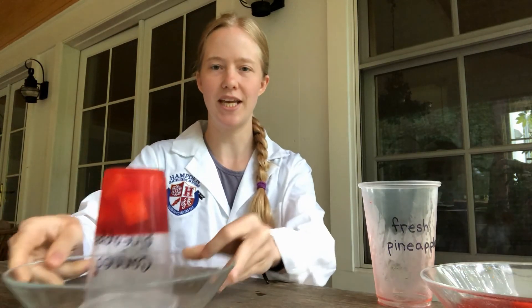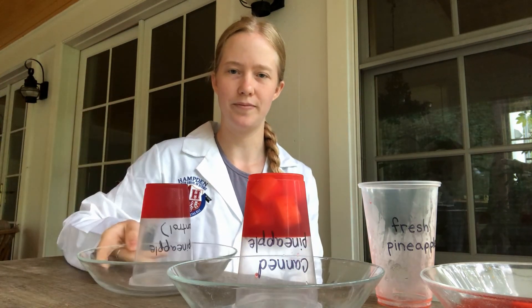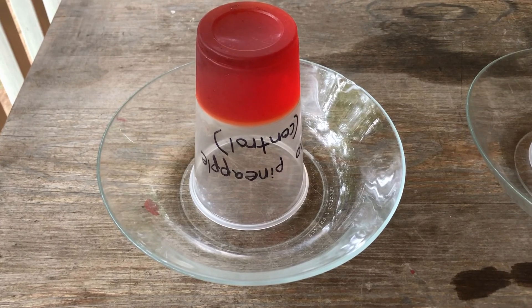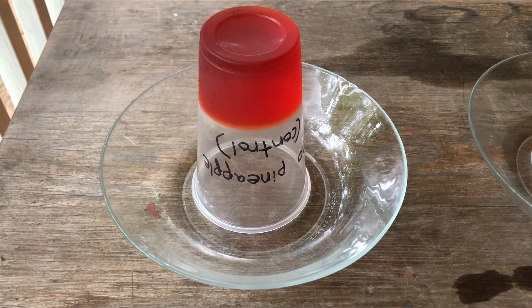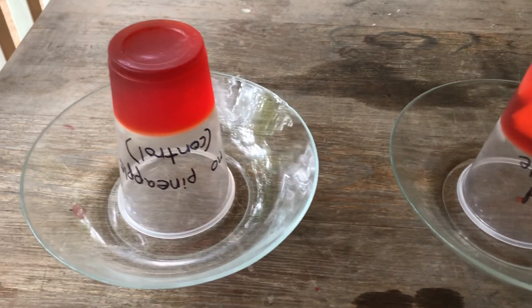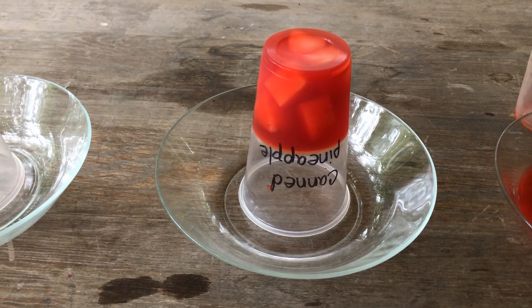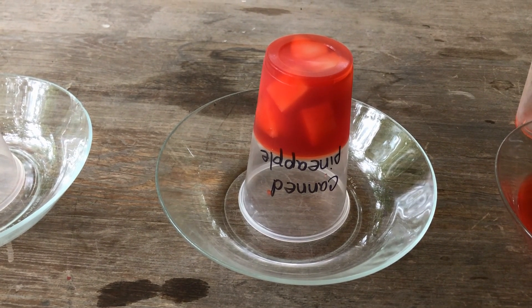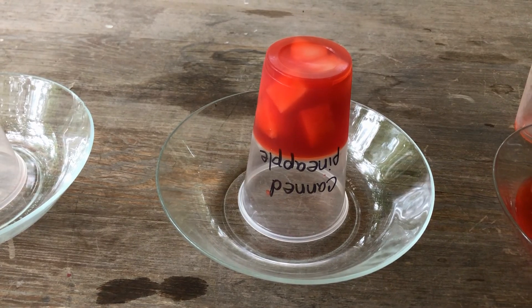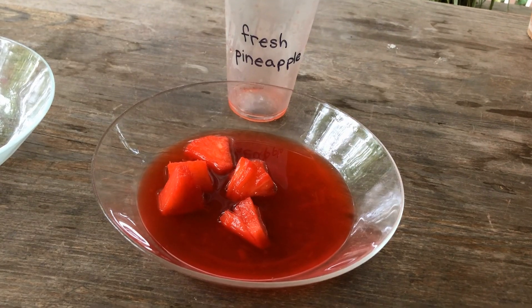So here's my fresh pineapple, here's my canned pineapple, and here is my control. Now that we've finished, you can record the data, check to see if your hypothesis is supported, and draw conclusions. You could even design a new experiment to see if other types of fruit affect gelatin the same way that pineapple does. Maybe there are other plants that also produce the enzyme bromelain.